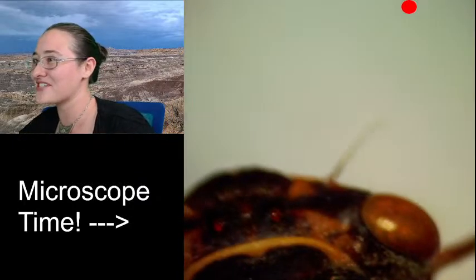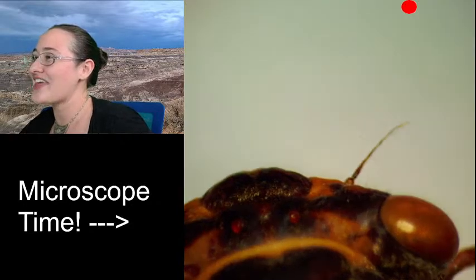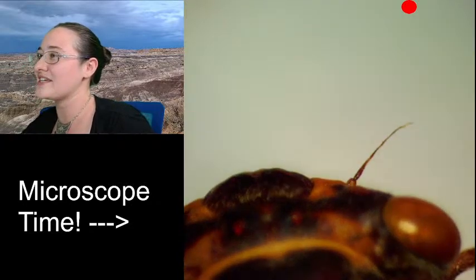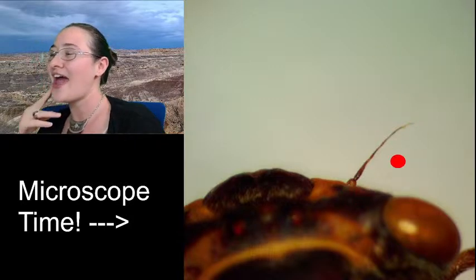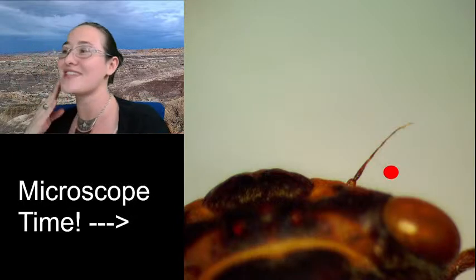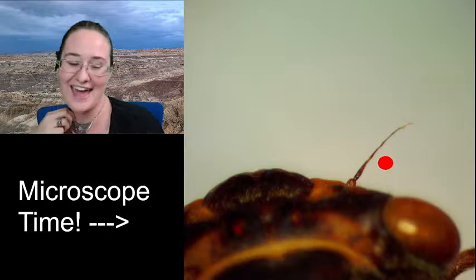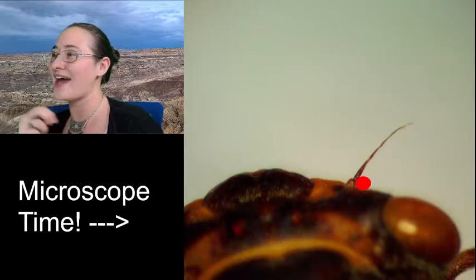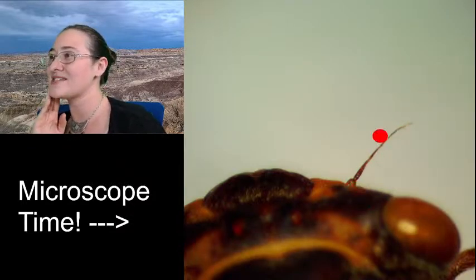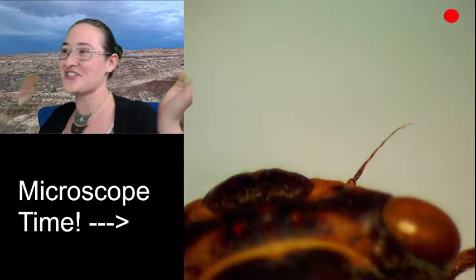All right, so normally at the end of that little stalky segment, there is this hair. And that hair is visible from the dorsal side as long as the antenna's not broken off. So you can go ahead and add that, and I probably will also add the little segment at the base and then the long hair. That's what they're supposed to look like.